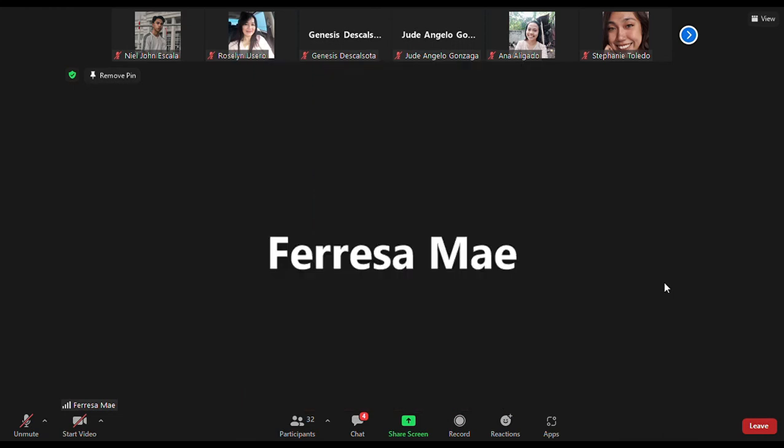So itong rapid moisture analyzer, mabalaan naton kung okay na ang iyang reading, ga-alarm na siya.